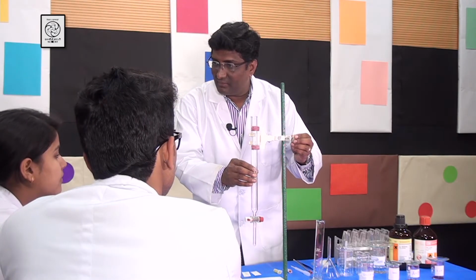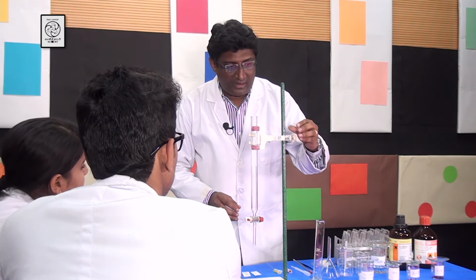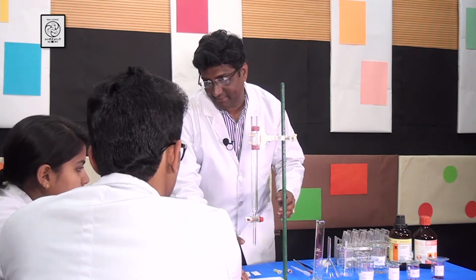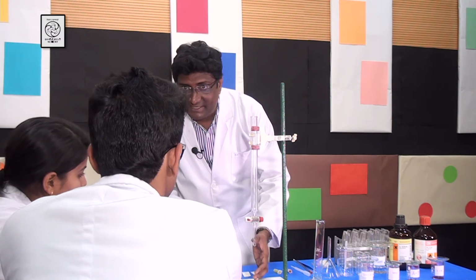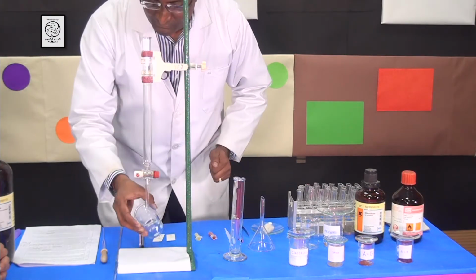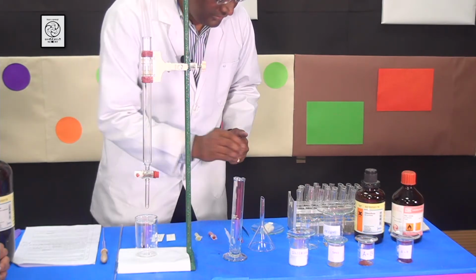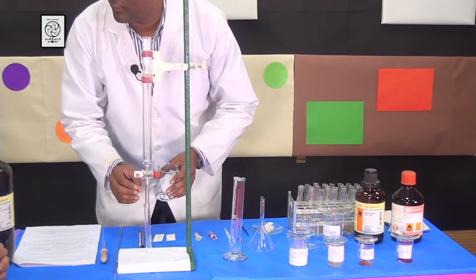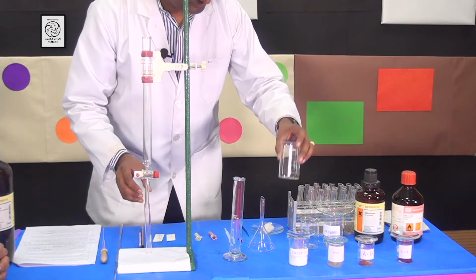So students, you can see that I have fixed the column to the stand and tightened the screw so that the column doesn't fall down and break. I left some space at the bottom so that I can collect the compounds by putting a beaker or a test tube at the bottom of the column. Okay? Okay, sir.